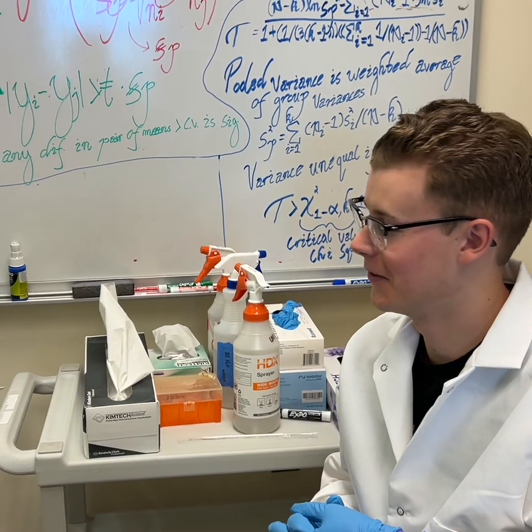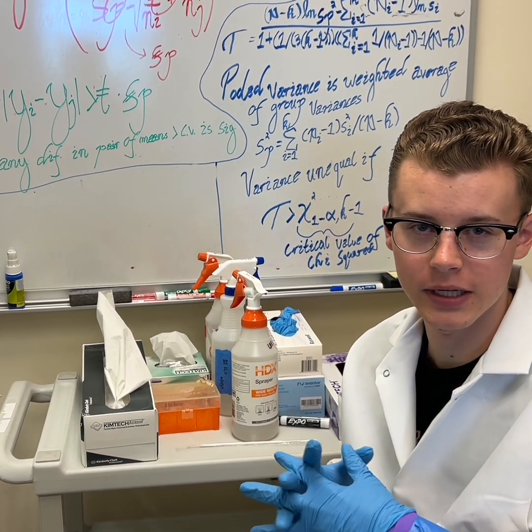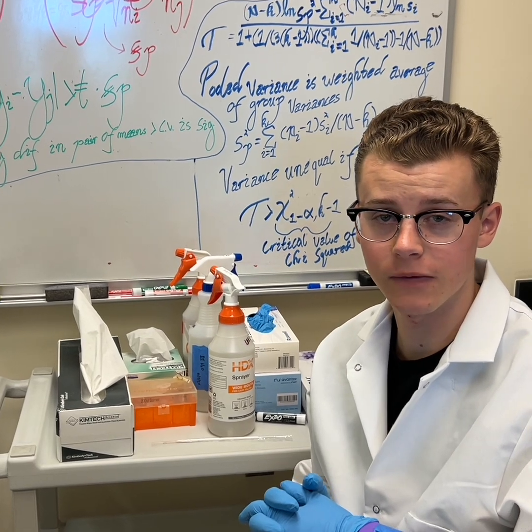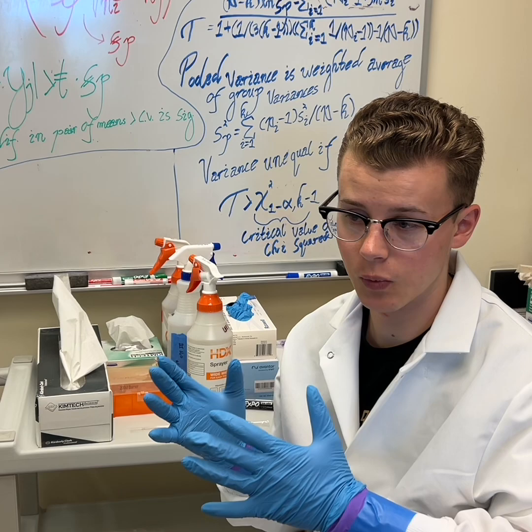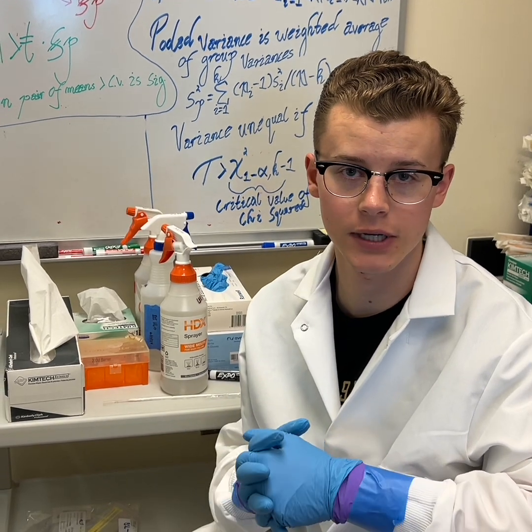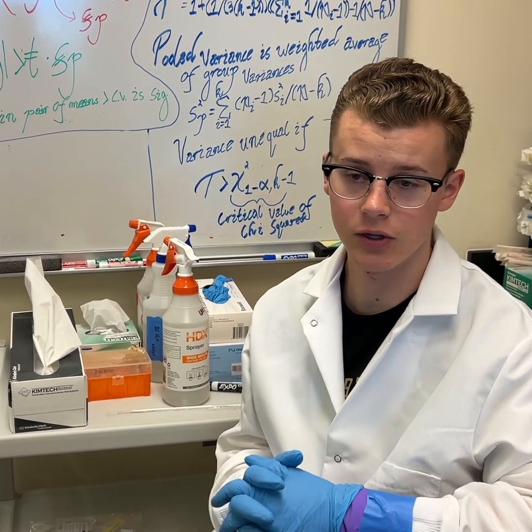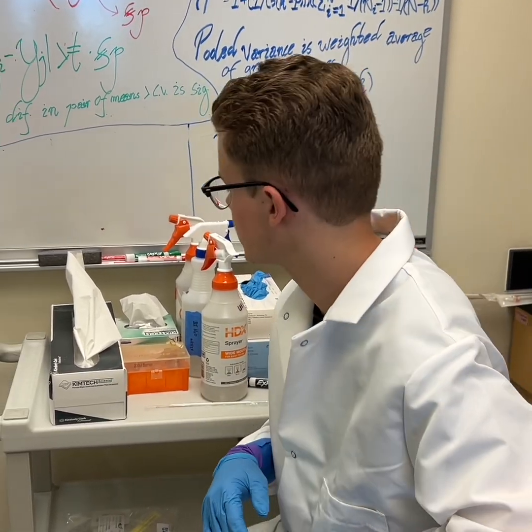Okay, so now our Candida albicans biofilms have been incubating at 37 degrees under CO2 for 24 hours. You can adjust that length based on what the assay is testing for. For really mature biofilms, you can go like 96 hours. And for planktonic cells and active biofilm formation, you can do less than 24 hours. But we're doing 24 to 48 hours.